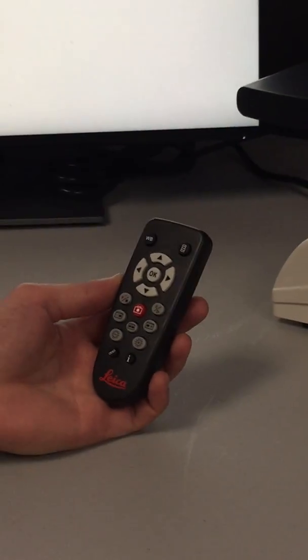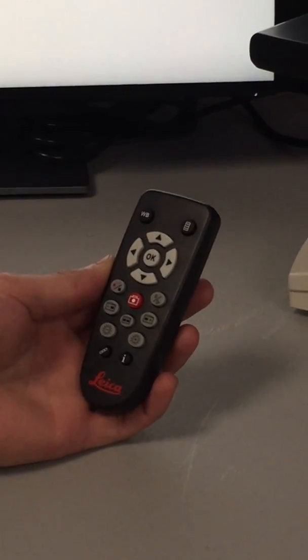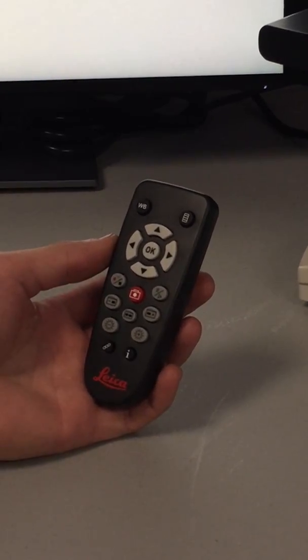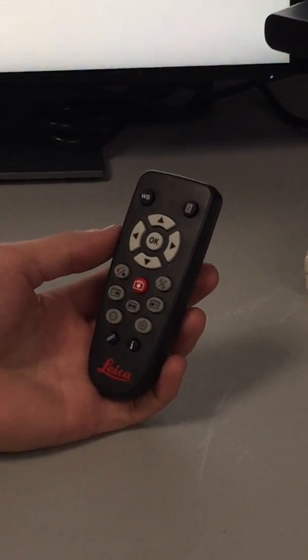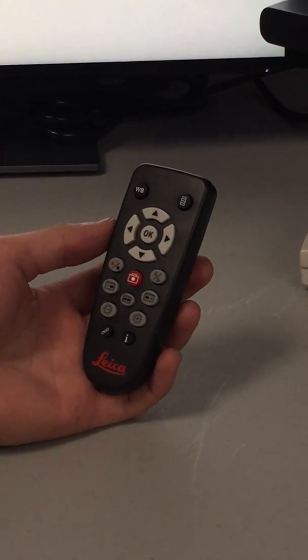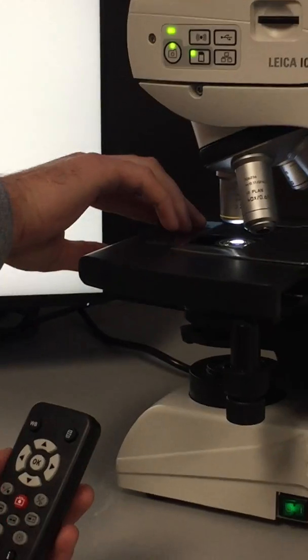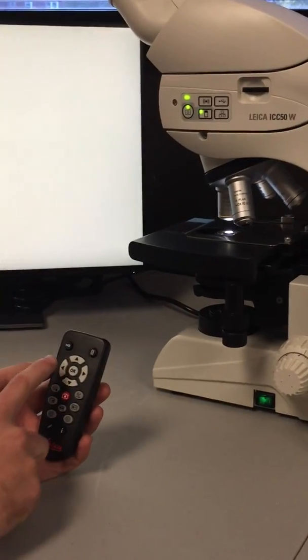One of the features of this camera is the remote. This optional remote allows you to control the camera when it is in HDMI mode. One of the most important buttons on this remote is the white balance button.